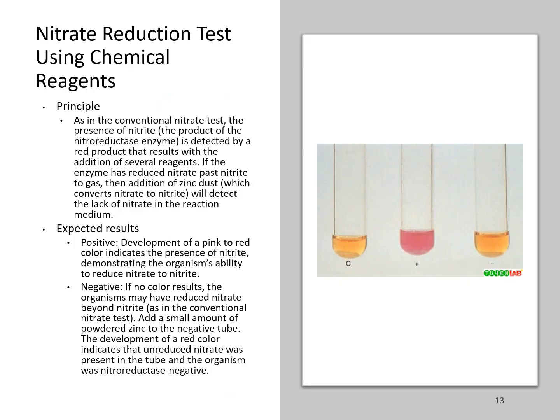Nitrate reduction test. Again, there are a couple of different methods. You can have a disc method as well as broth methods. And this is looking for the presence of nitrite, which is detected by red products or a pinkish color change.